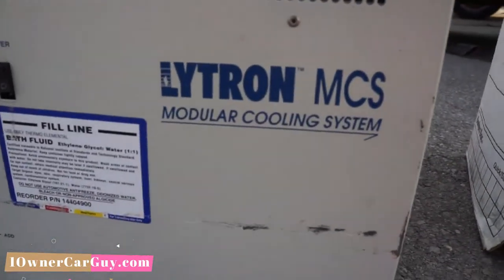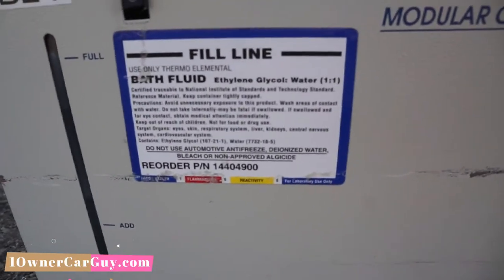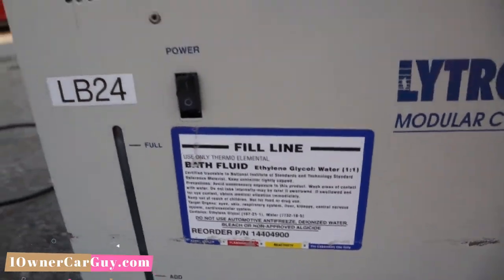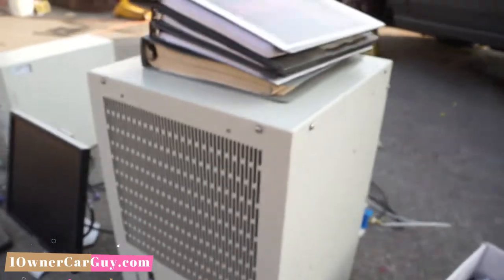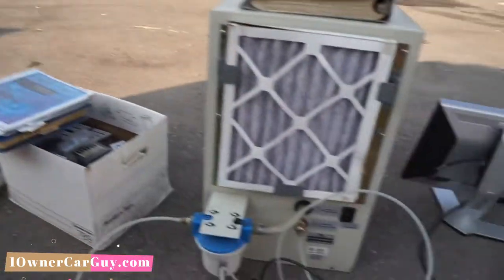This water system is a Lytron MCS modular cooling system — ethylene glycol. And that was hooked into the side of it.